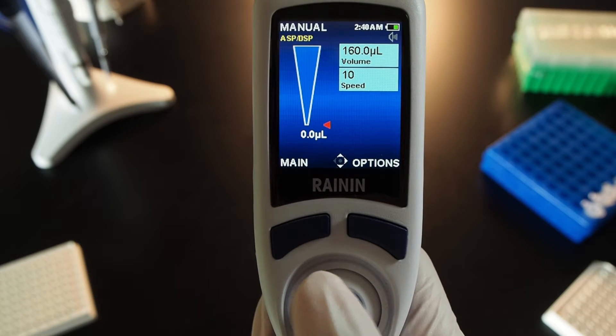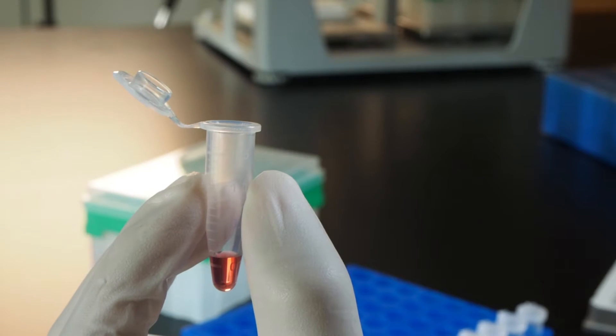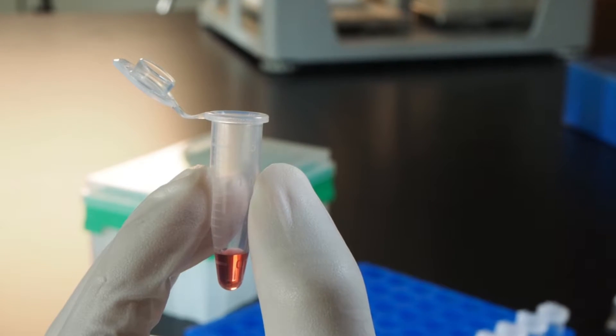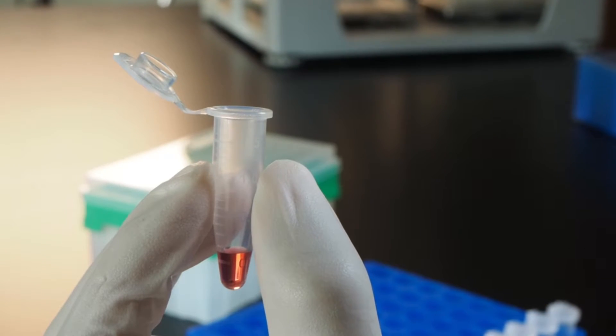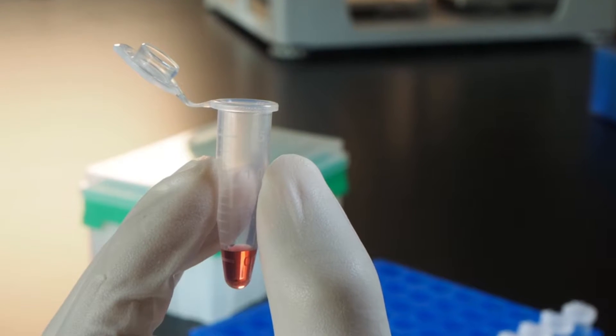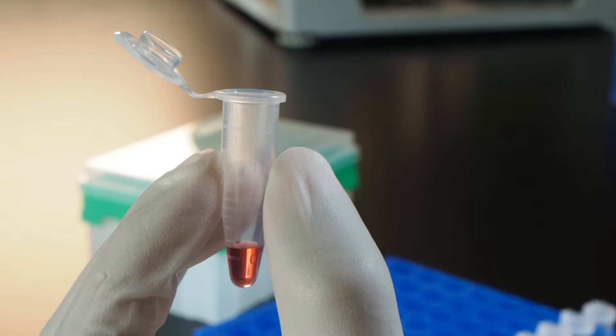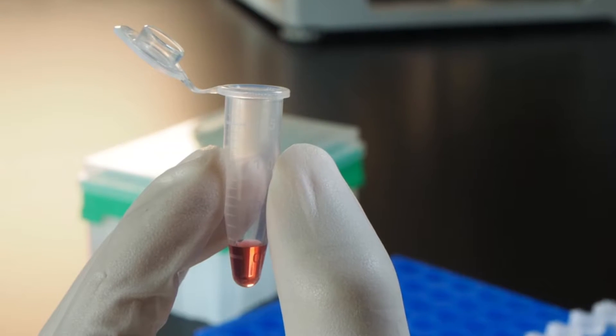Press reset on the left to begin a new cycle. To measure a volume, take a look at the sample in the container and slightly overestimate its size. If this is your first time estimating a volume inside this type of container, take a moment to familiarize yourself with how different volumes look by dispensing a few volumes into it and noting the levels.